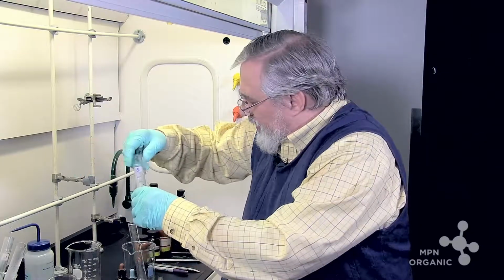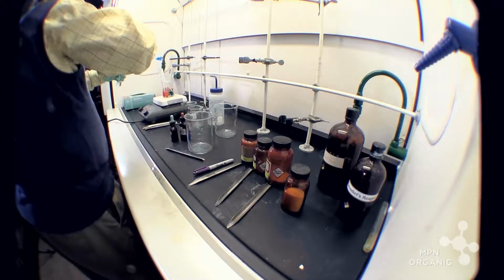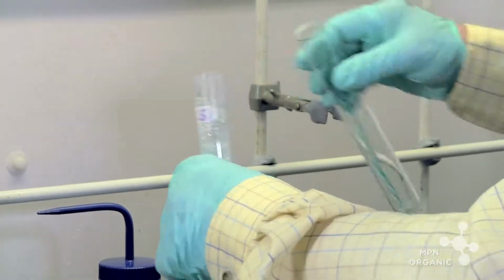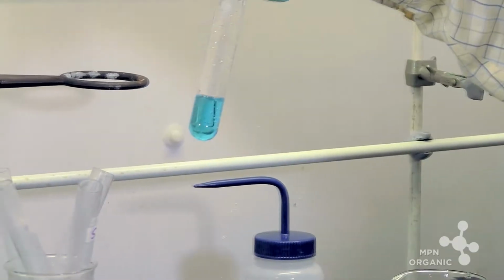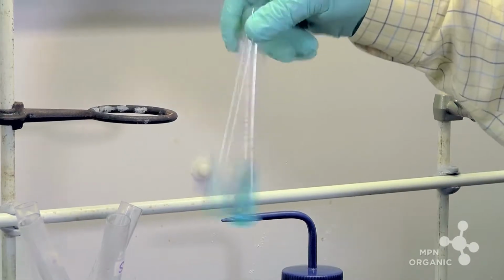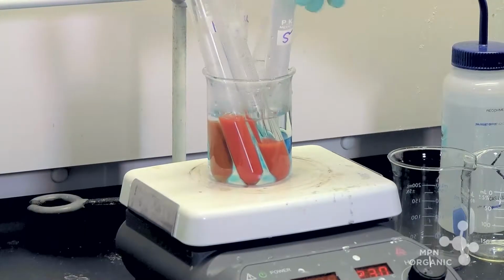So let's see what will happen if I add some Benedict's to this. Whoa! You can see what happens. The acid that I put in there is going to make the carbonate fizzle a little bit. We'll see what happens.